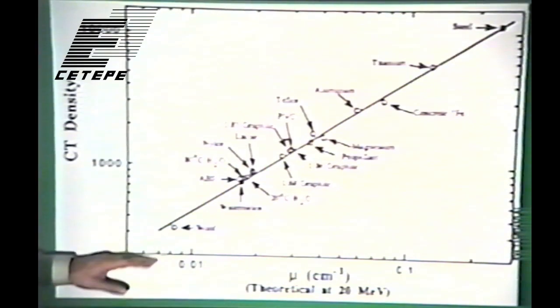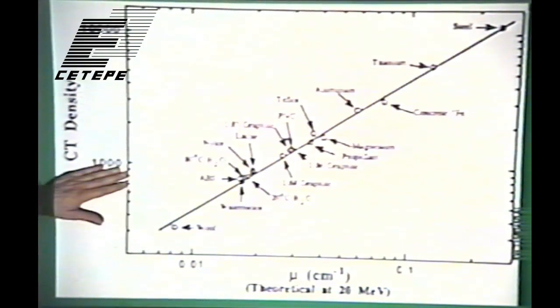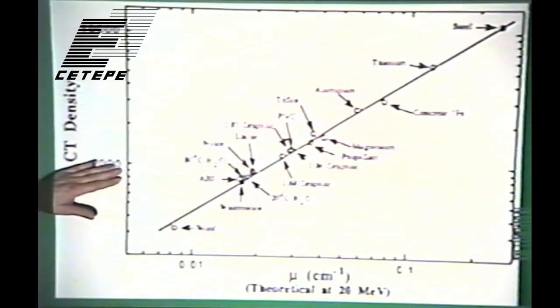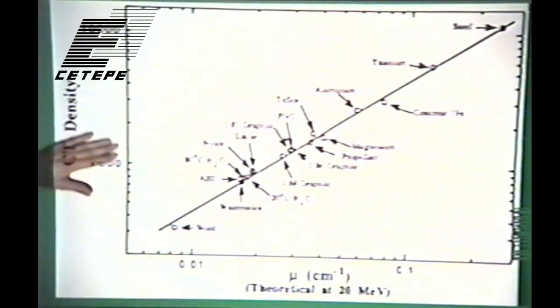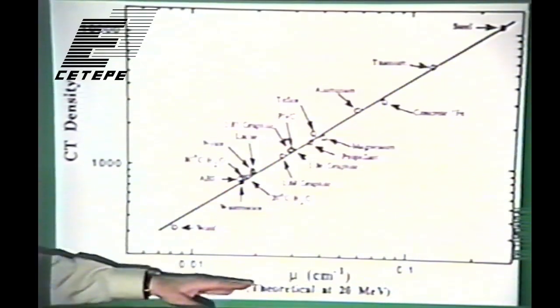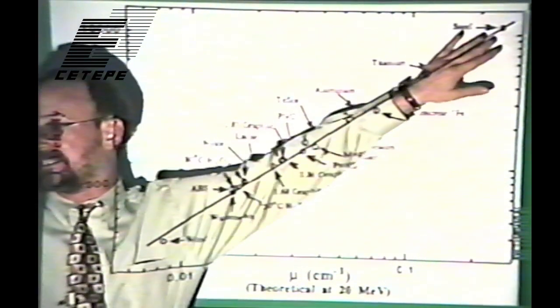And then what it shows you is that in the body, these CT numbers, also called Hounsfield units, that we'll talk more about later, range from -1,000 to 1,000. So bone has the highest CT number in the body, about 1,000. And this is just showing you on this log scale that the reason you need such huge energies is to blast through materials like concrete, titanium, and steel.